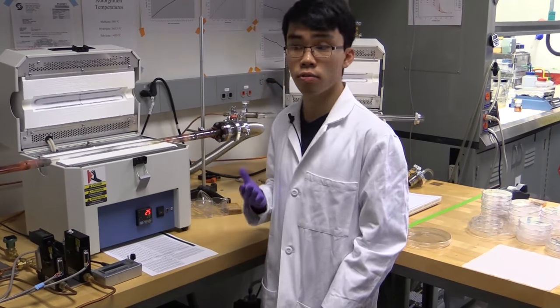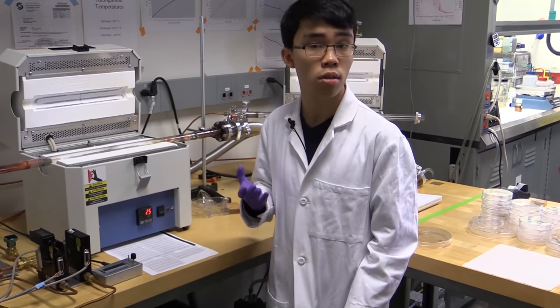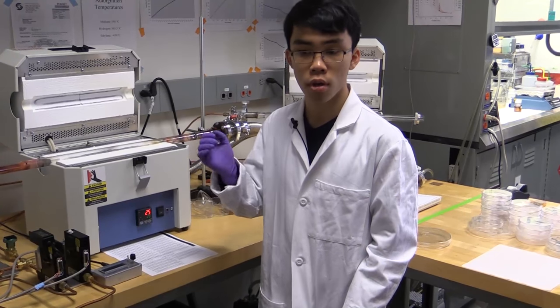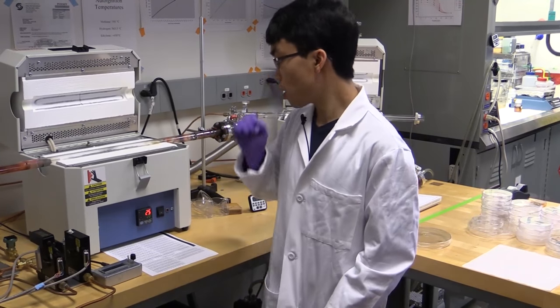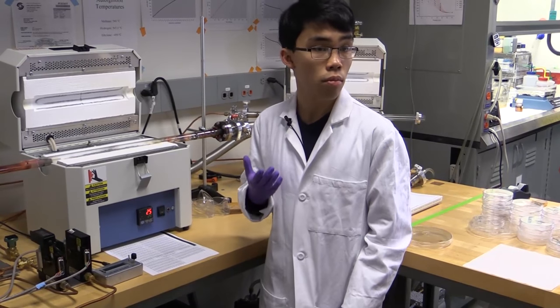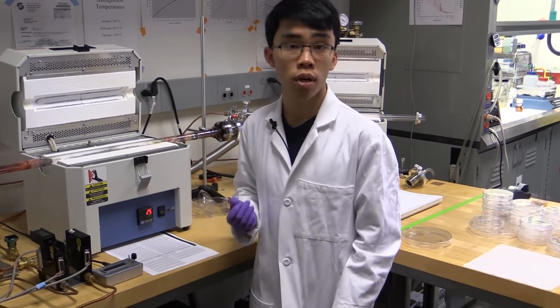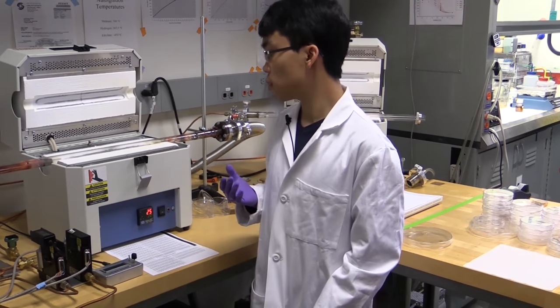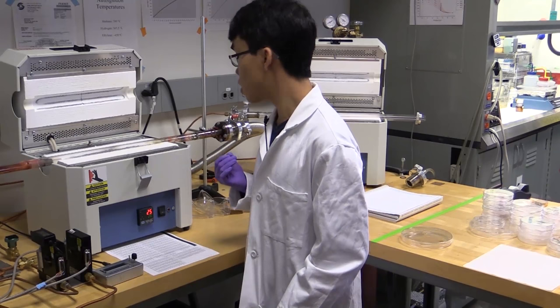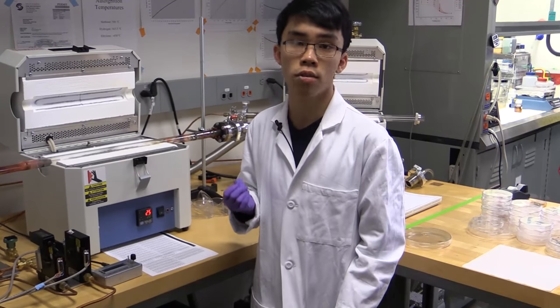This technique is very powerful, very simple, by using just solid source as opposed to vapor source. On a lab scale it produces many samples for testing and experimentation. However, for clean energy research, it is missing one core quality, that is scalability.